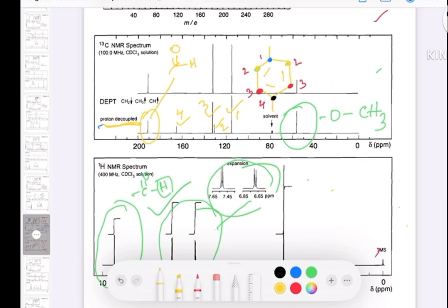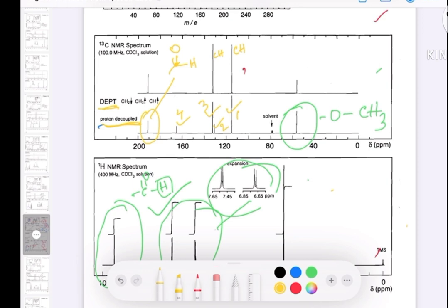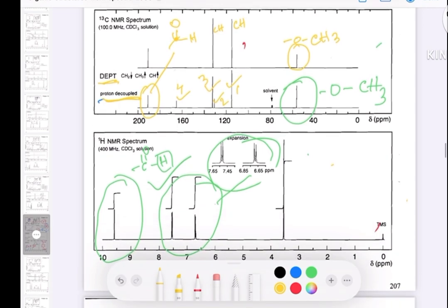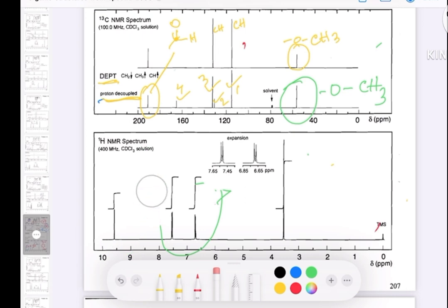The DEPT spectrum shows CH peaks pointing up. There is also a carbon around 50 to 60 ppm that appears up in DEPT, and we already know this is a CH3 group — the methoxy. So now let's compile all the information we have.